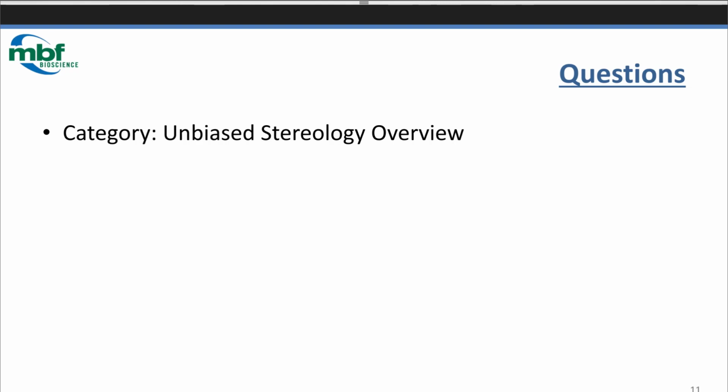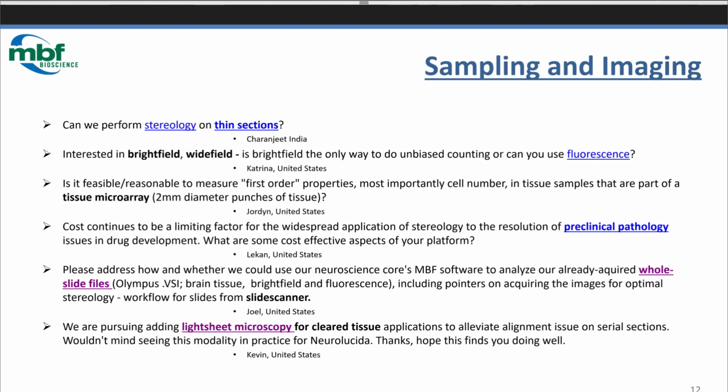Okay, thanks for those questions. I really appreciate that. In the interest of time, I'm going to move on to the second category now, and that is sampling and imaging. So we've already talked about the fact that we need to use systematic random sampling. These sampling questions deal with other aspects such as imaging, and this first question from Charanjit from India, can we perform stereology on thin sections?